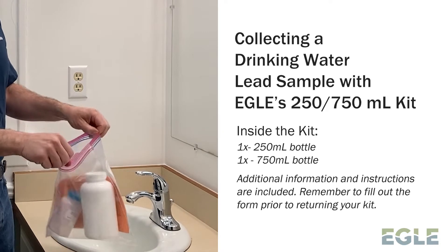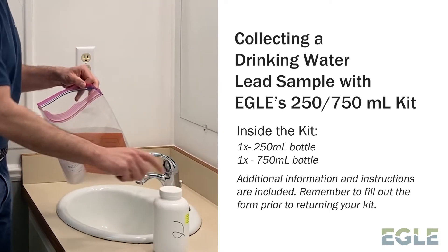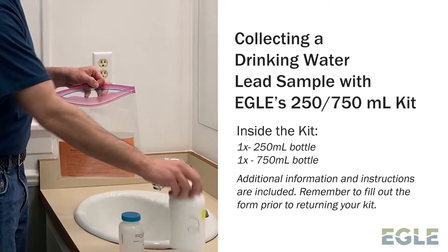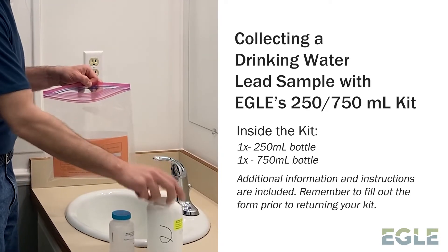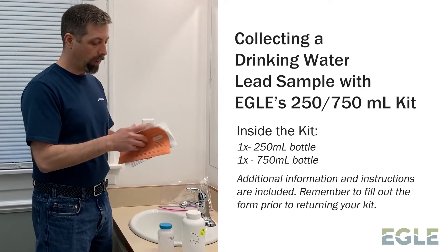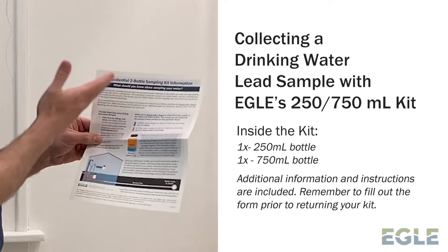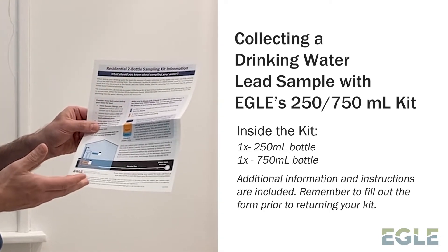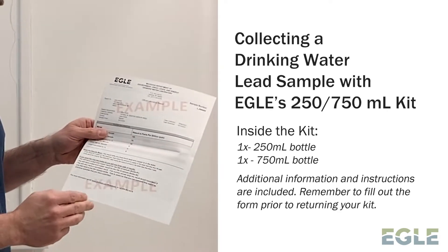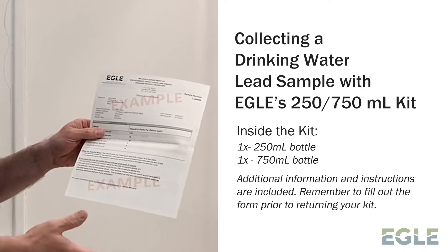First, when you get your kit, you'll open it up and take a look at what's in it. There's two bottles — this is the 250-milliliter bottle, and this is the 750-milliliter bottle. Then there's two pieces of paper. The first piece of paper explains what this 250-750 test kit is going to do for you. The back side is an example of the lab report you'll receive after these samples get analyzed.